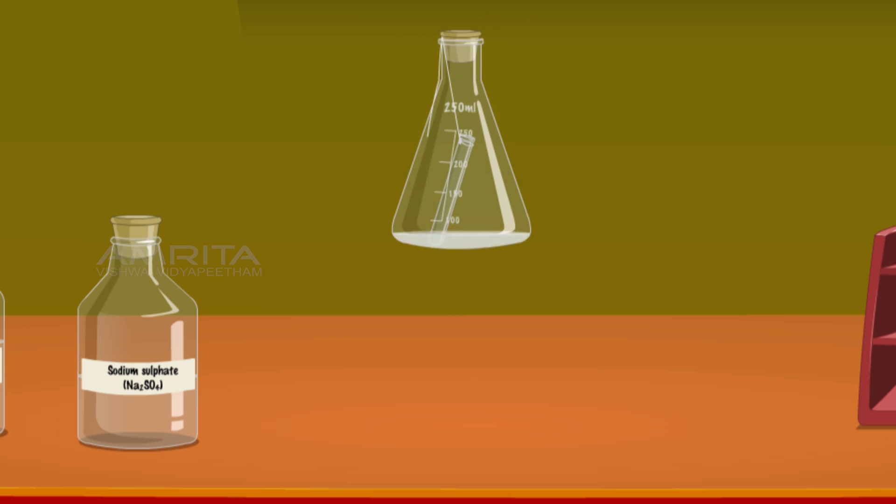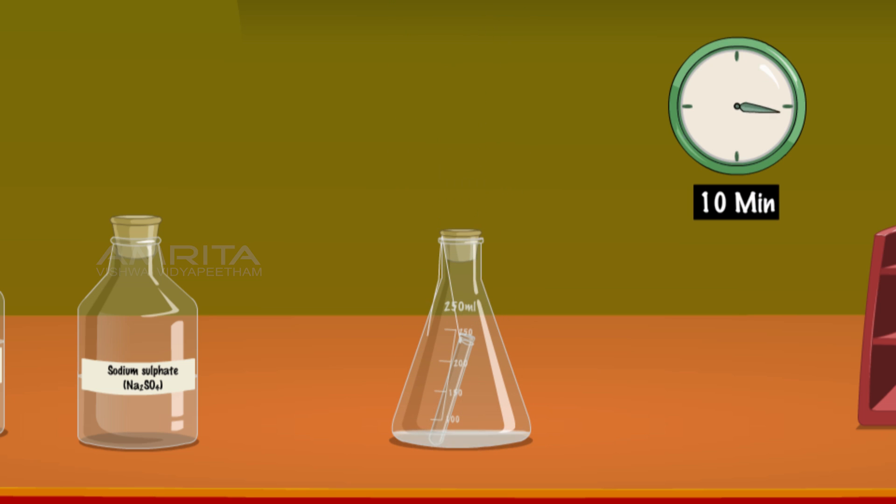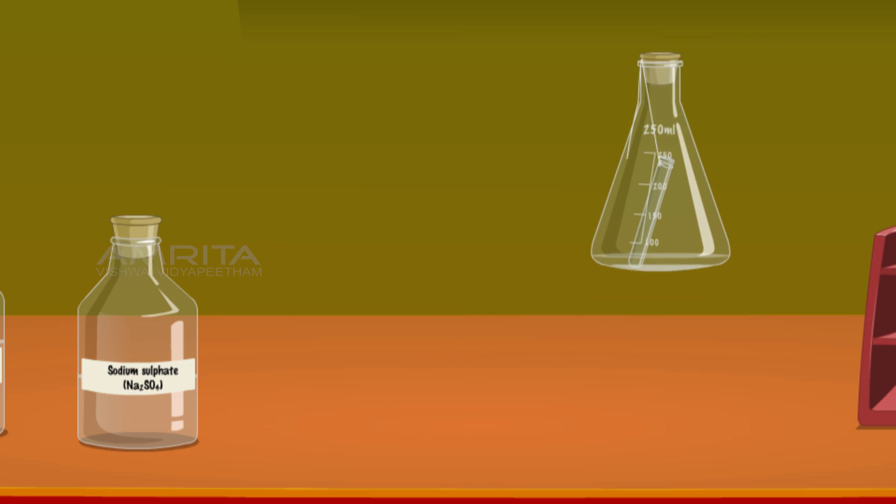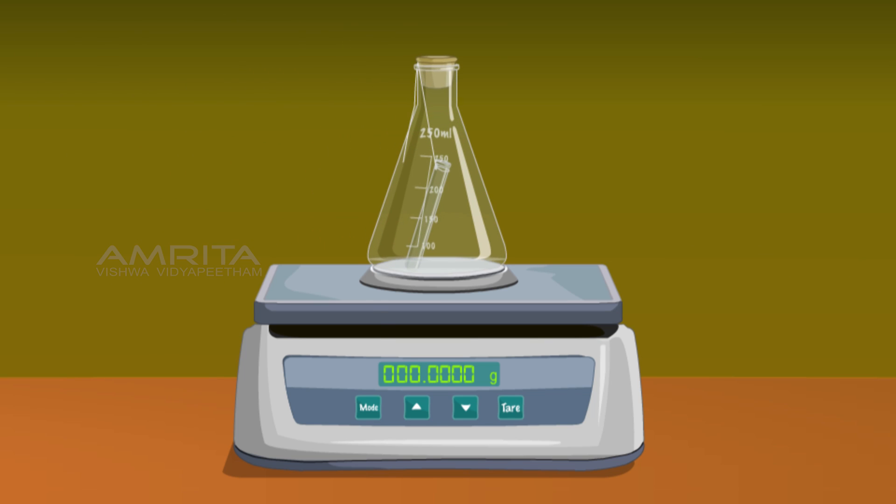Wait for 10 minutes to complete the reaction. The precipitate of barium sulphate settles down to the bottom of the flask. Weigh the contents of the flask again and note down the reading.